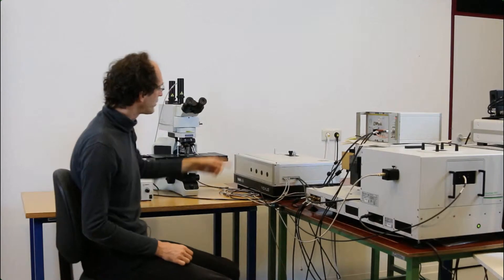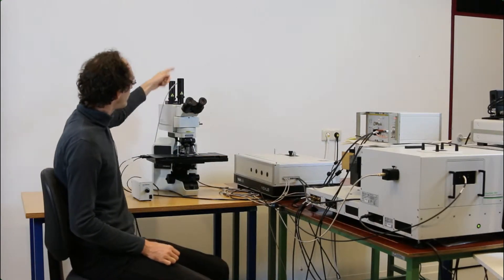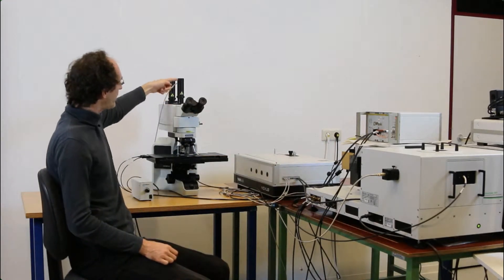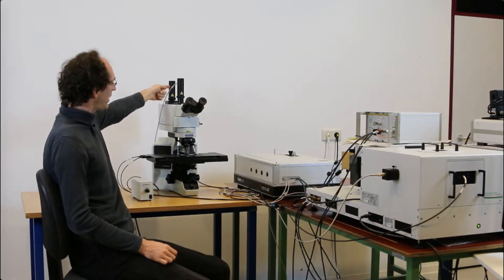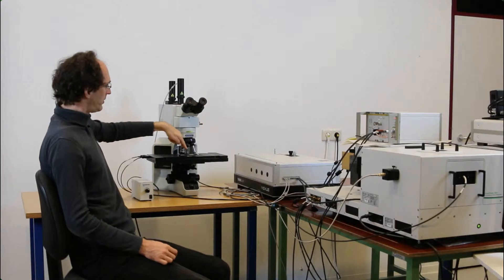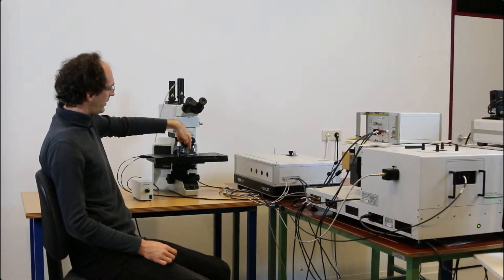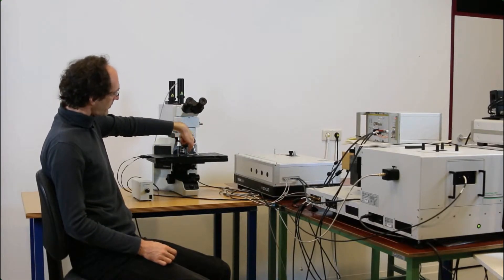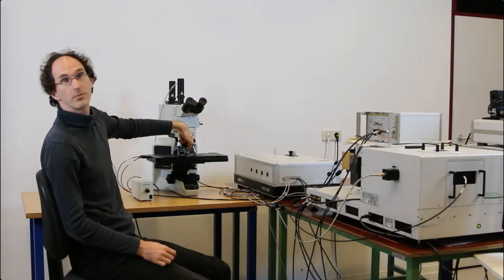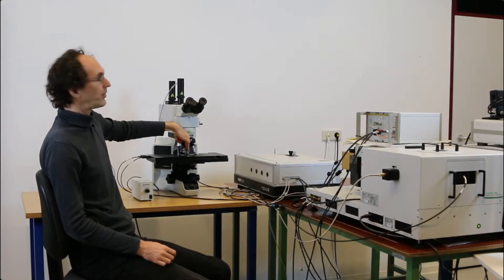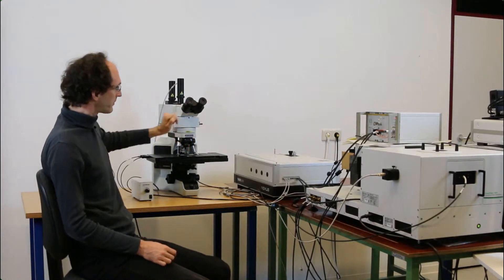On the other hand, you can measure via the microscope. Then the light is delivered in this fiber and then focused here below the objective on the sample.